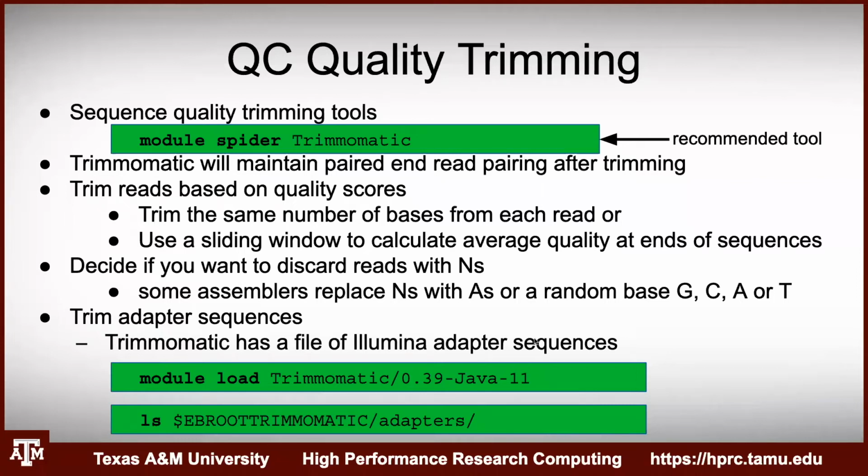Let's look at this. So whenever you're running Trimmomatic, you'll need to provide the adapters. Cutadapt has the ability to automatically detect which Illumina adapters were used in the library. So you can provide it with the adapter sequence, or you can let it auto detect.